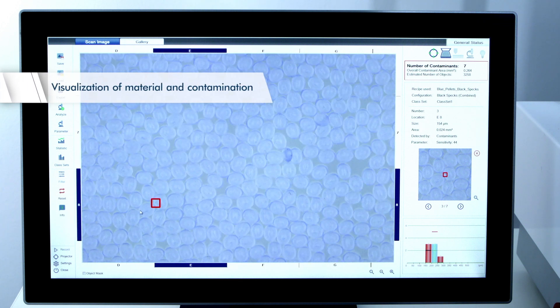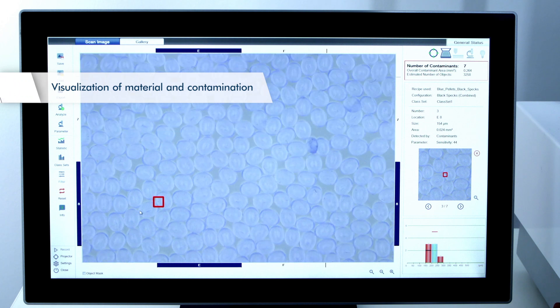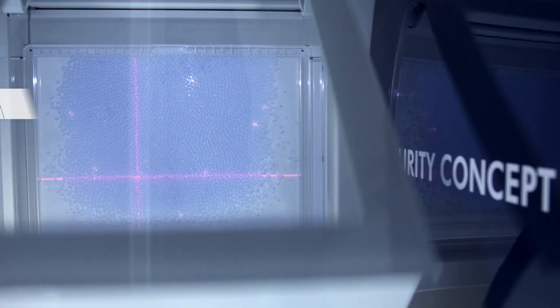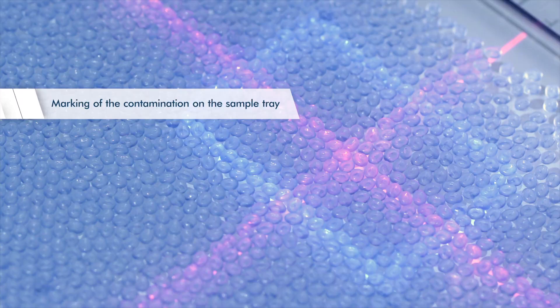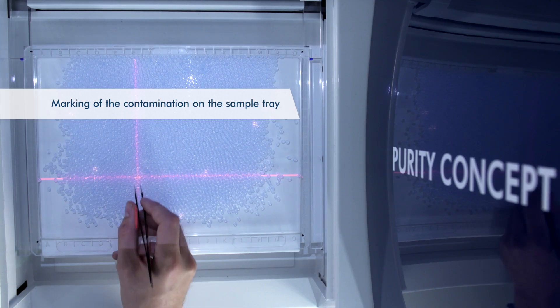The material is visualised on the included monitor. Detected contamination is optically highlighted. Simultaneously, a projector marks the contamination in colour directly on the sample tray and allows the operator to specifically remove it.